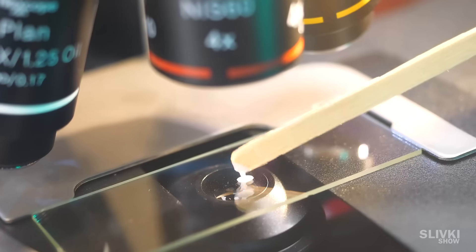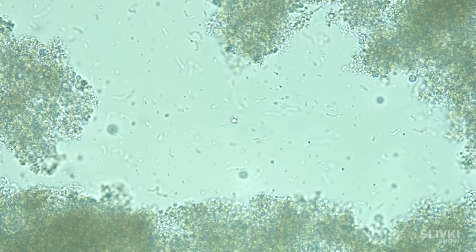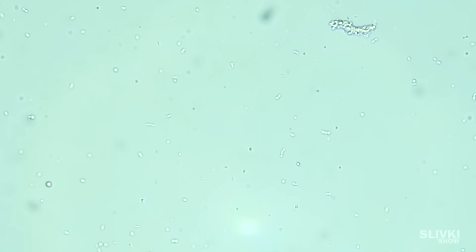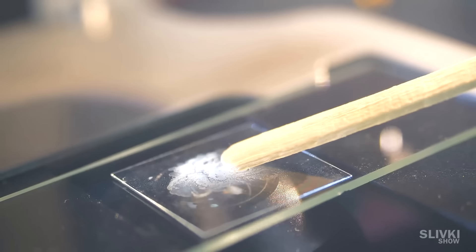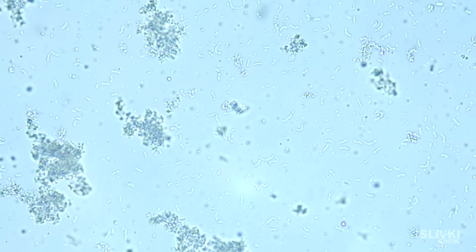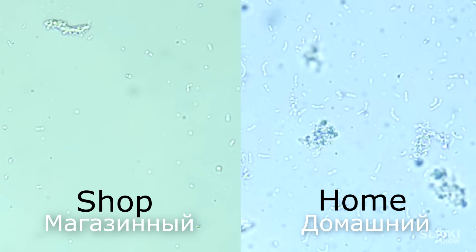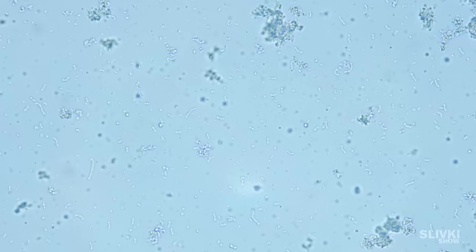Store-bought and homemade yogurt — let's look at the store-bought first. Yes, there is some bacteria in it. You see all these hooks and sticks? That's what good bacteria looks like, so the manufacturer is not cheating. Now let's look at the homemade yogurt. Wow, there is bacteria in it — a lot more than in the store-bought yogurt. It seems much more vivacious. They're supposed to be alive, because they're what turns milk into yogurt.